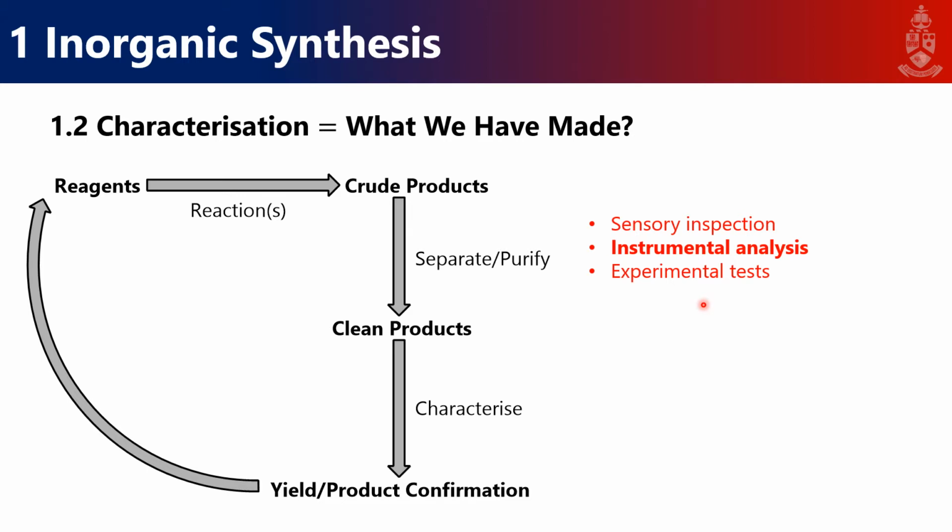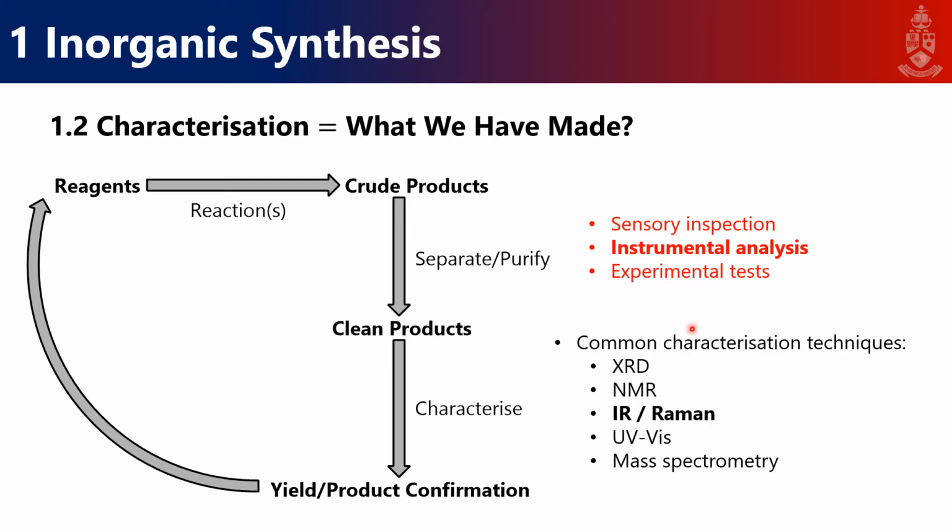Like with the chromium prac, which we used the purity test with ammonia to see whether or not the polar one dissolved and the non-polar one did not dissolve. That was our test. So elaborating on instrumental analysis, in this practical we'll be using IR.